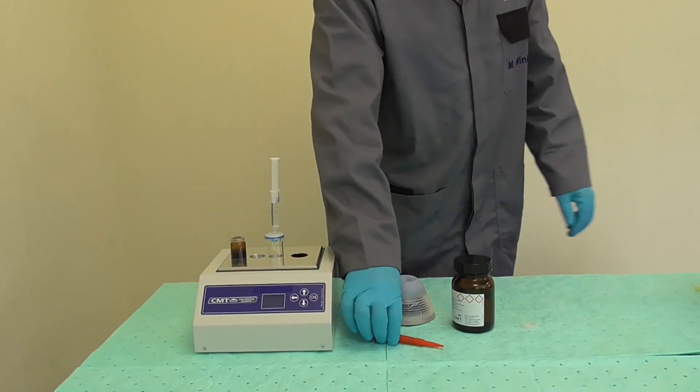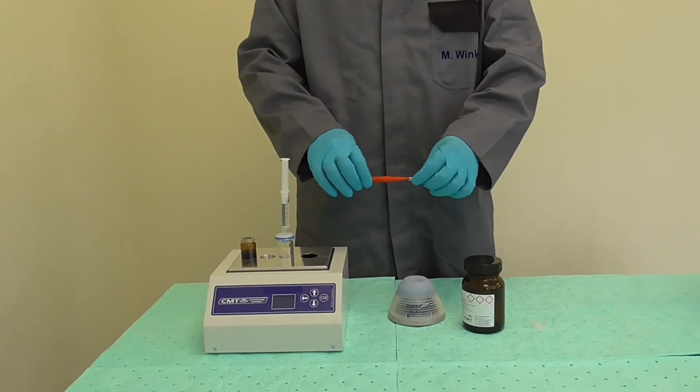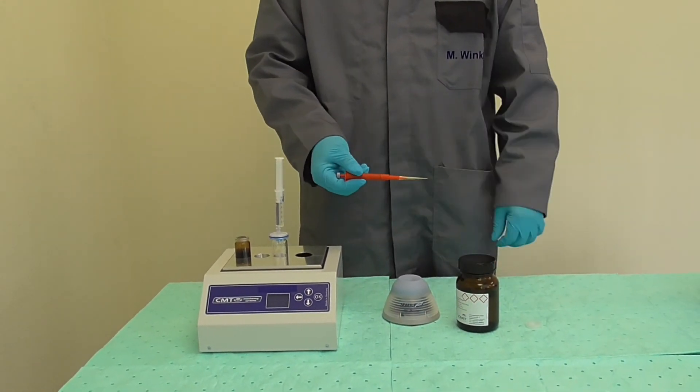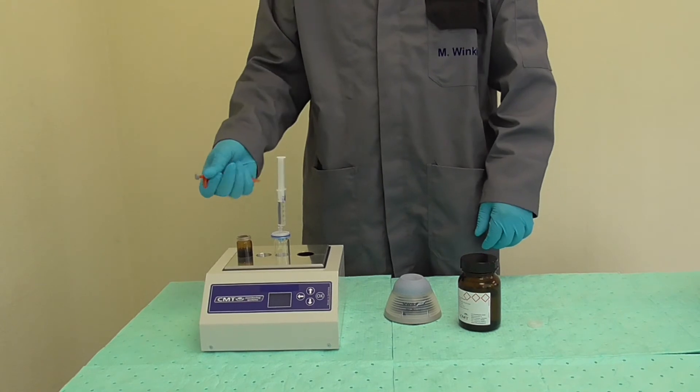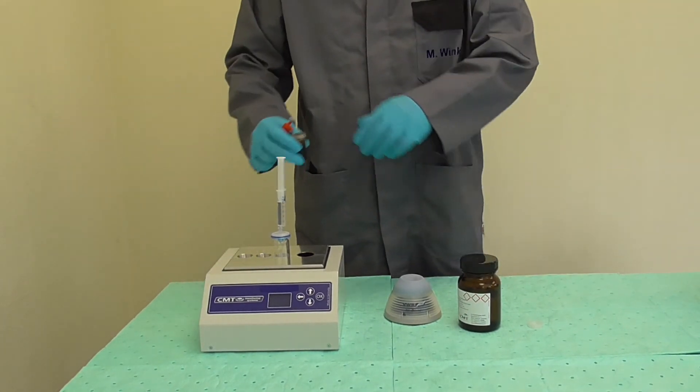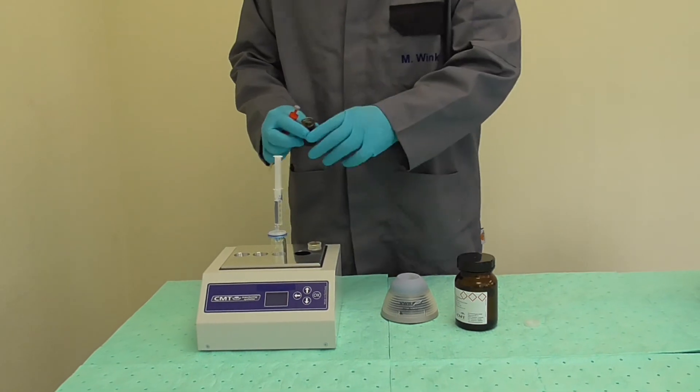Take the supplied micro pipette and put a disposable tip on top of it. Open the vial and take a full load with the micro pipette from that vial.